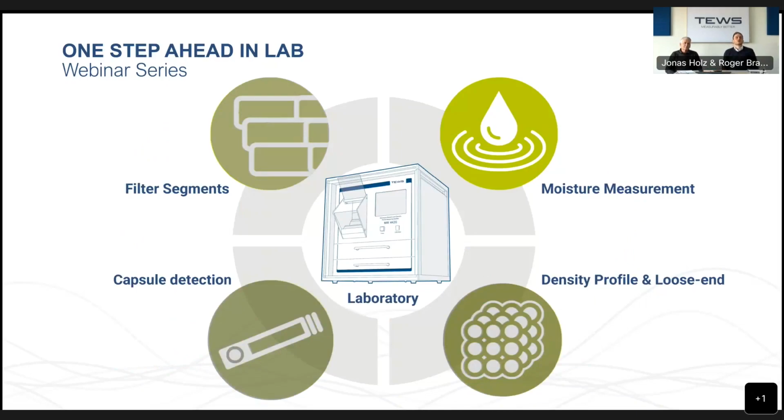What are we going to talk about today? Today is the kickoff webinar for our webinar series called One Step Ahead in Lab. During the webinar series, we will have different webinars and we'll cover interesting topics out of the tobacco industry, and all the topics you can see here in this picture. And for today, we will talk about the moisture measurement.